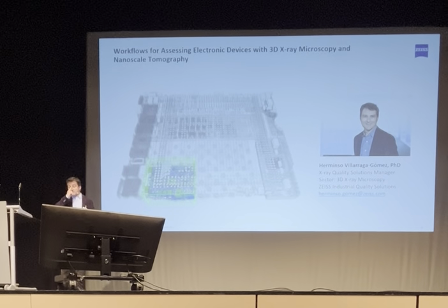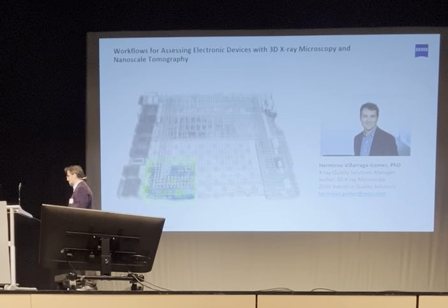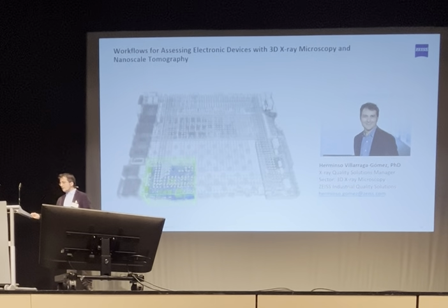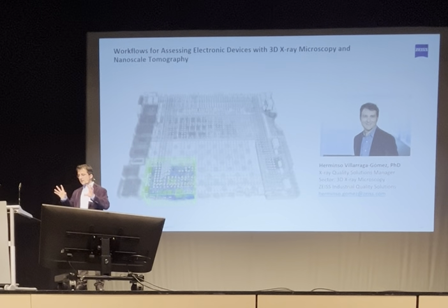The second question is about what if you kill the device with the X-rays. That could happen if you increase the power or scan the device too many times. From my personal experience, I haven't seen too much damage, and a typical device is still functioning if you use below 160.